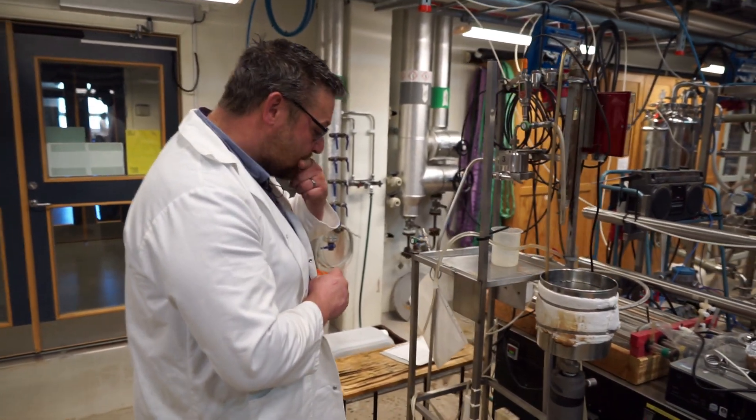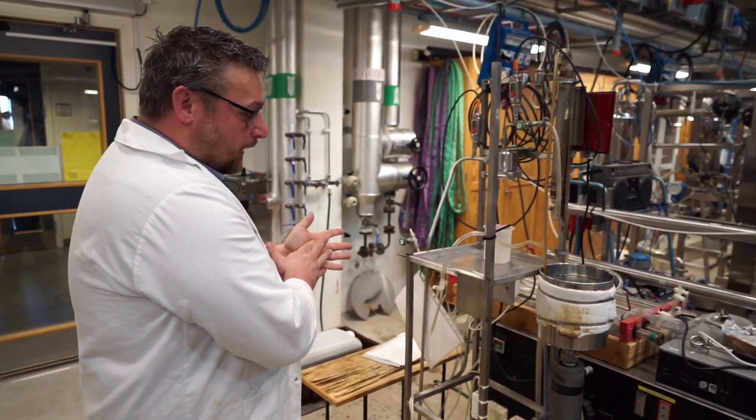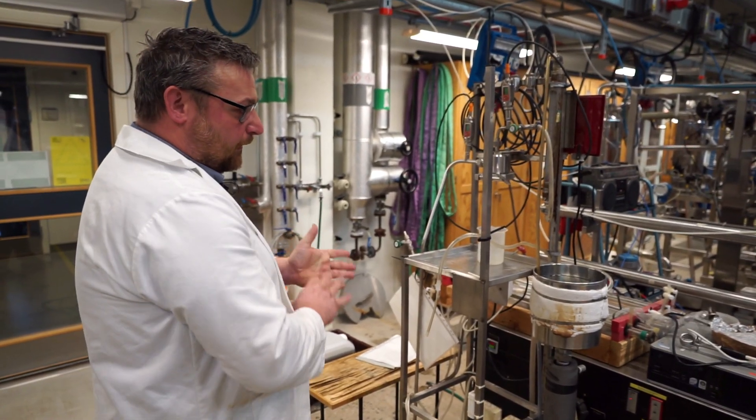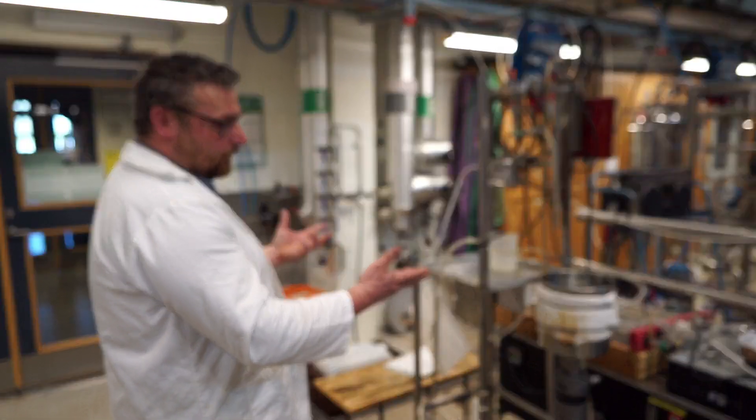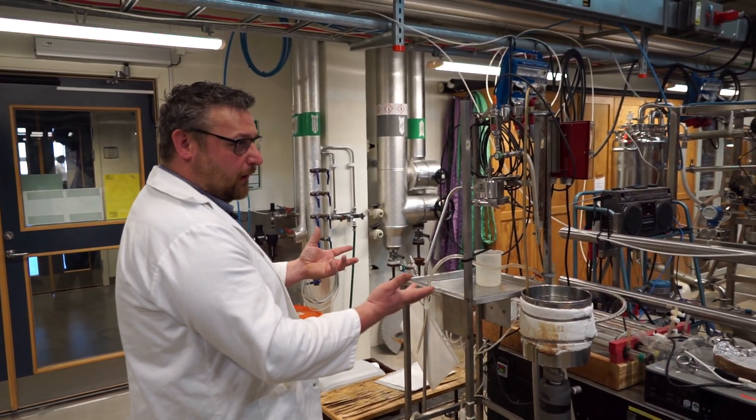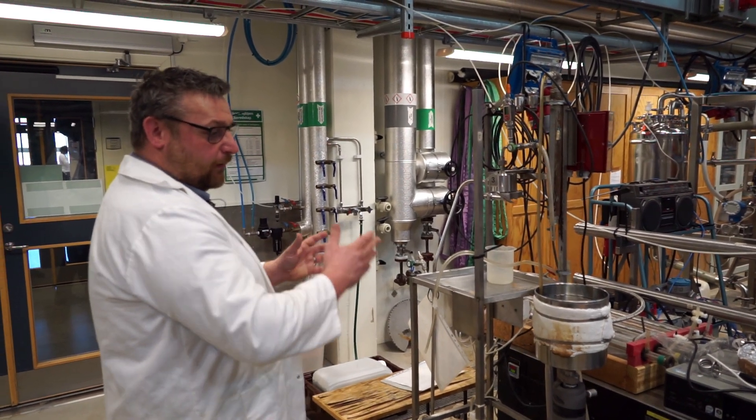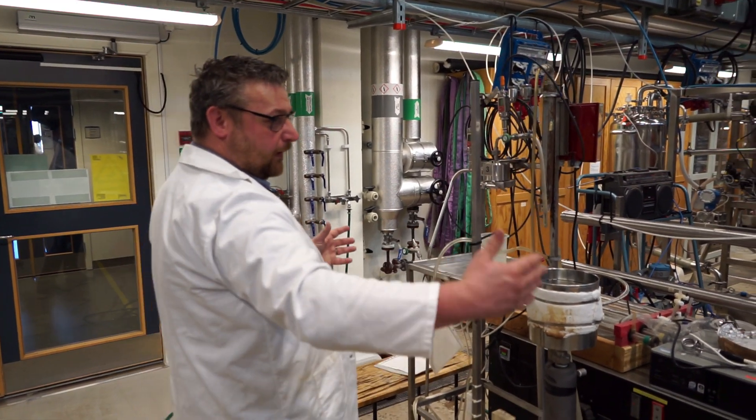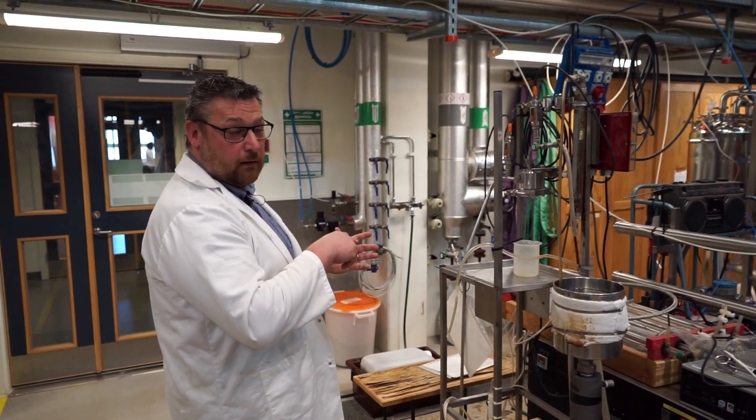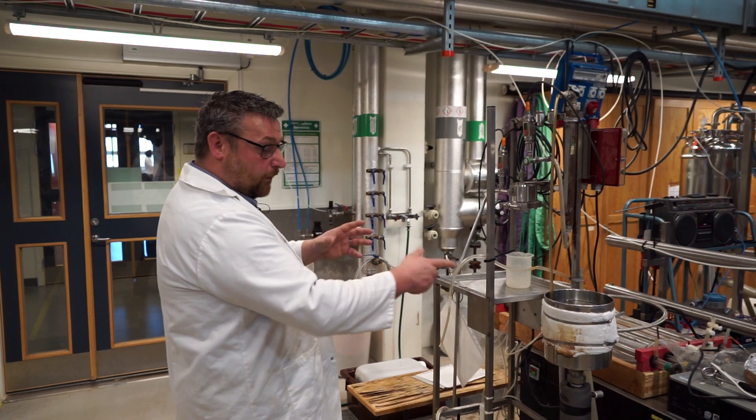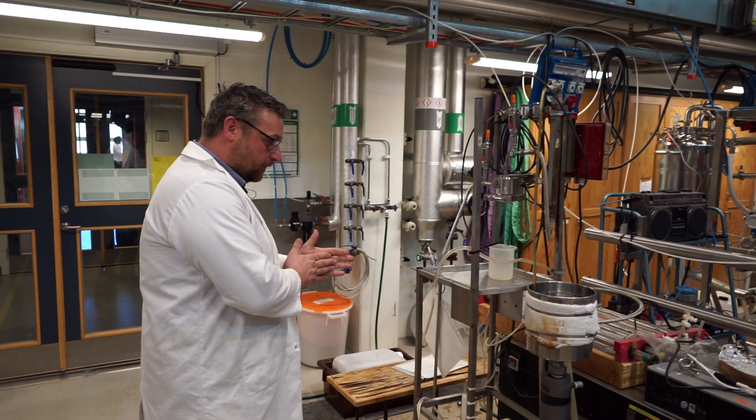Yeah, we saw the big difference in diameter there with the pipes and the outlet there. And if you go out in industry, you do not use batch equipment to the same extent. But you might use several equipments in series with an internal recirculation instead of through a tank. So then you have a multi-stage equipment instead. Okay.